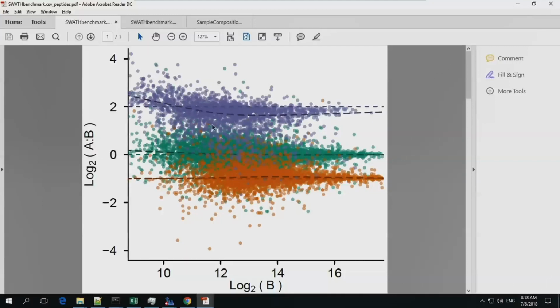But anyway, definitely I thought, oh, okay, well, the E. coli, I mean, we didn't see this effect in the paper. With the paper data, these lines came very close to where they were supposed to be. So the fact that this data has this effect, to me, I was like, okay, maybe what we saw in the IRTs is some indication that there is actually a sample handling problem, and we reduce the effect by that. So anyway, that's one thing.